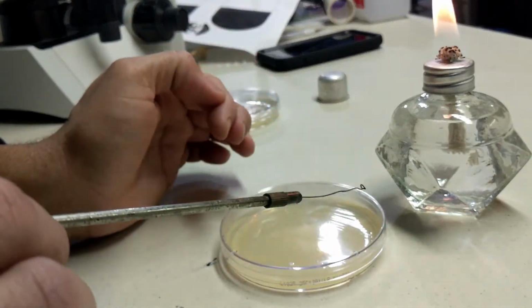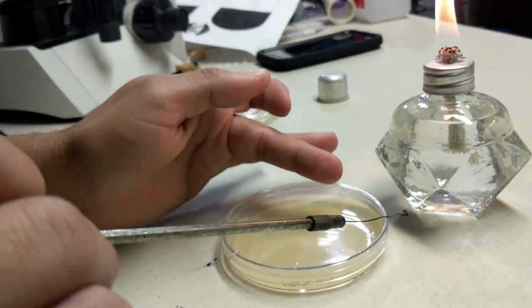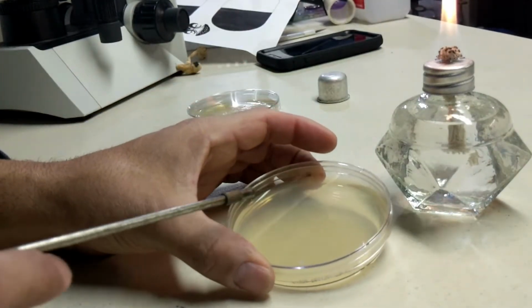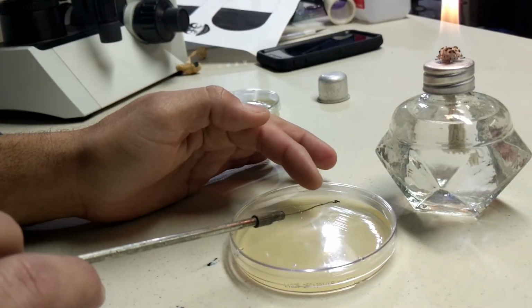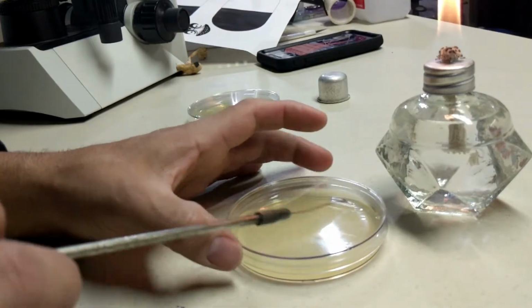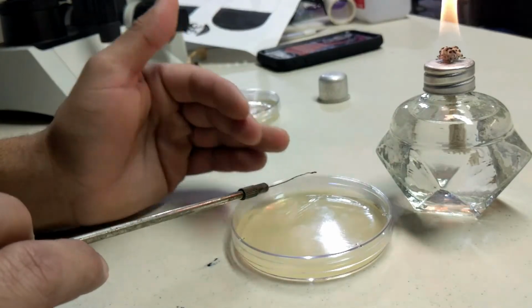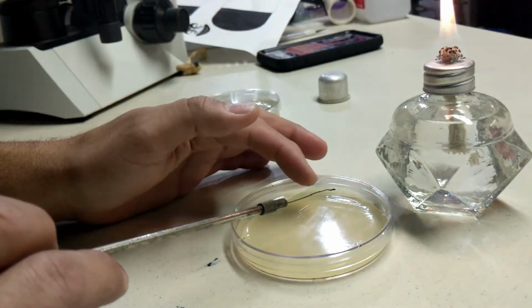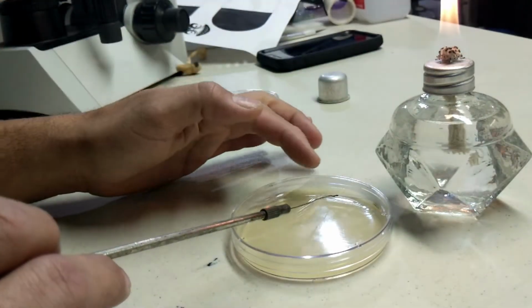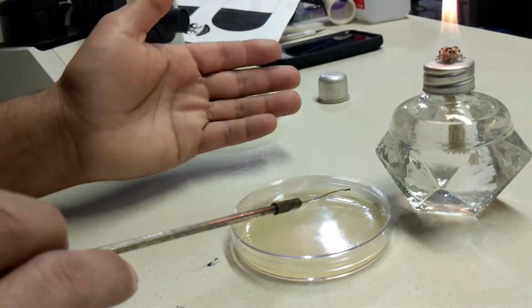And remember, what we want to do in a streak plate of isolation is from here to move it, right? To dilute this sample. Let's say we have 100 microorganisms spread in these areas that we streaked. If I now touch this area from 2 to 5 or 6 times, we are only moving from this quadrant to the second one a few bacteria from that imaginary number 100, right?